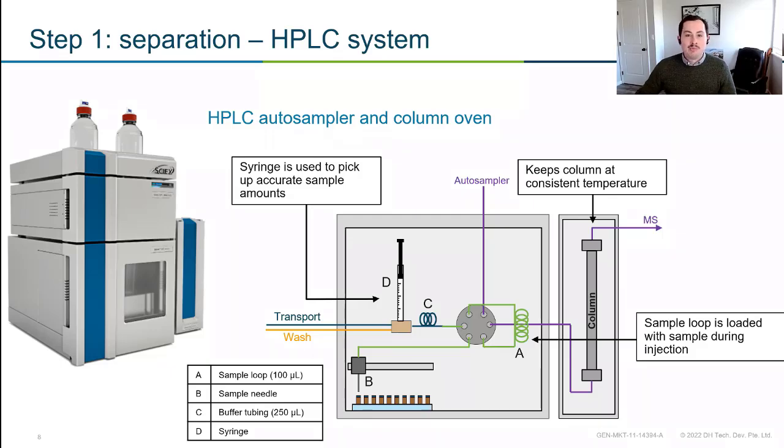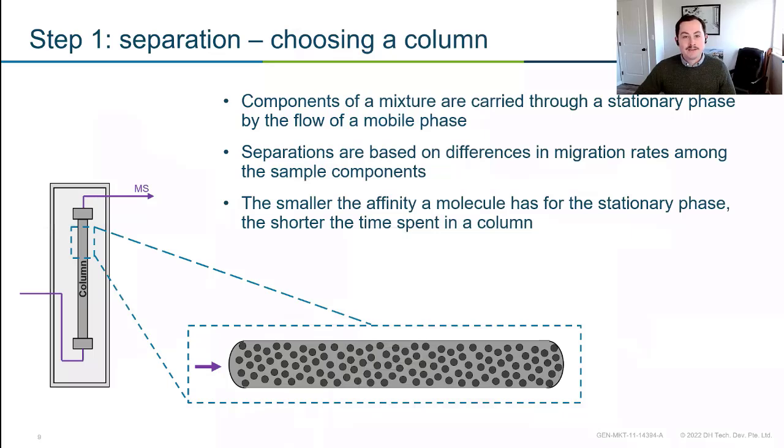But our analytes are passing through that column, and this is their chance to really interact with that column in some way. So how we're going to want to choose a column, rather, is to have the analytes of interest interact differently than the analytes we're not interested in. A really easy example of this would be salts. Salts are a mass spec's worst enemy. We don't want to introduce them to the mass spec. We wouldn't be able to analyze them anyway. So with an HPLC column or just an LC column, there's going to be really no interaction there with salts. So they're going to immediately just pass through a column while our analytes of interest are interacting with the stationary phase, and we can divert that to waste.